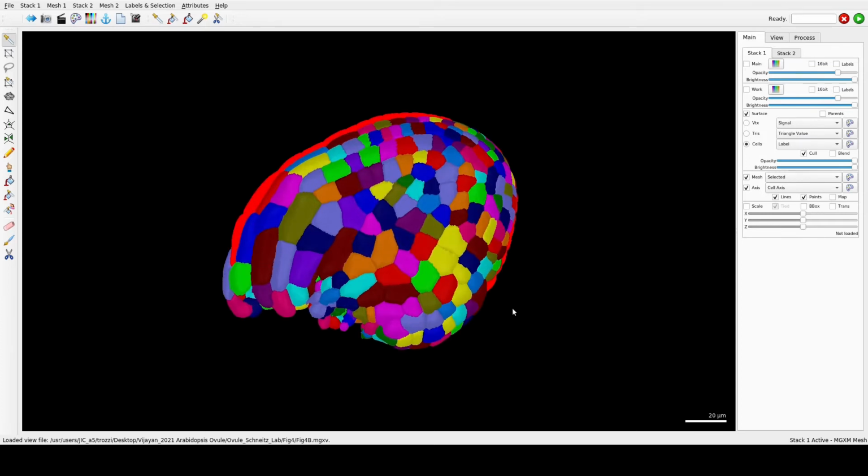Here, the principal directions of growth and other cell axis quantifications, such as shape analysis or microtubule directions, are calculated for each cell individually and can point in different directions for different cells. So it can be useful to align them into a specific direction, for example, to measure the cell growth along the proximal distal axis of an organ, which is this one.